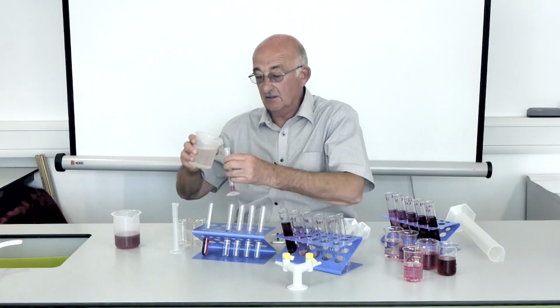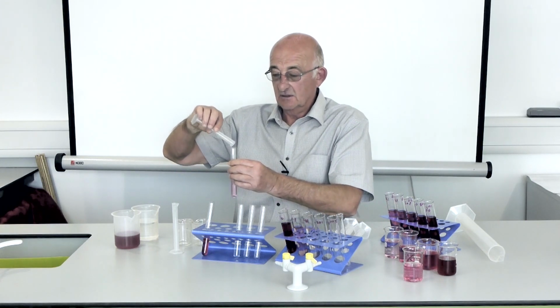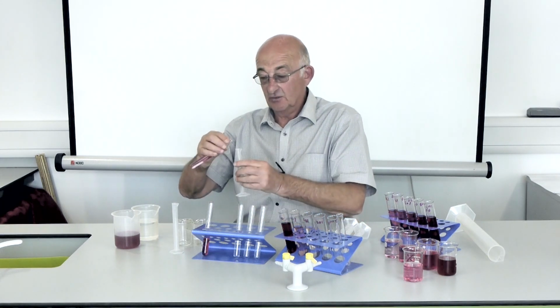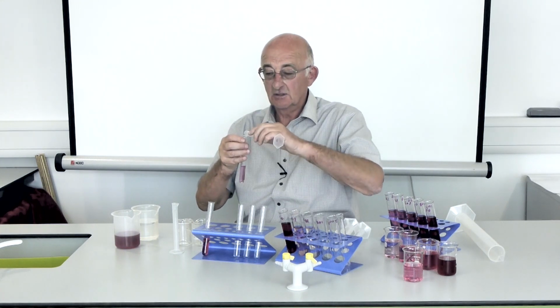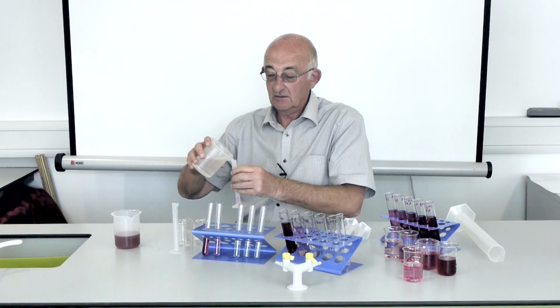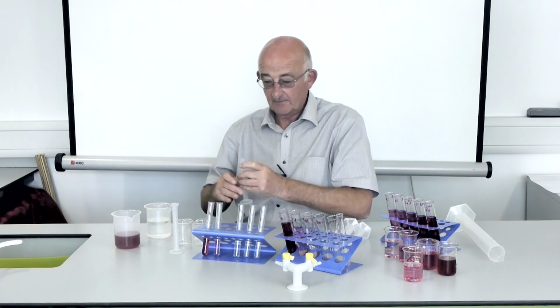Well, quickly, I'm just going to pour it in. It's been measured wonderfully by a pipette, and I'm going to put that into my next tube and label it up. So that will be 1, that will be 0.1. I need to take out 1 mil of this, and I'm just going to pour it into here for expediency. And oh my goodness, that's just a bit too much. Okay, I've carefully adjusted it with a pipette, so it's exactly 1 mil. I've carefully pipetted in 1 mil, and 9 more mils of water to make that up to 10. Well, that's not bad.